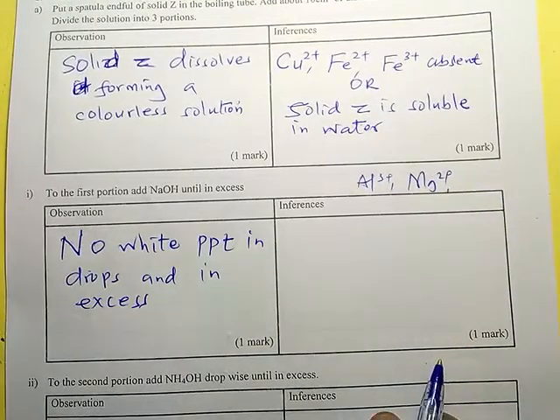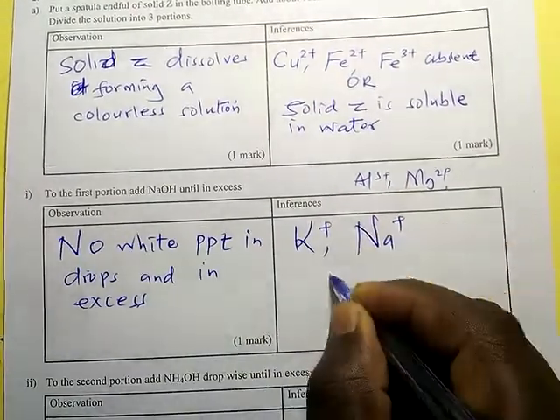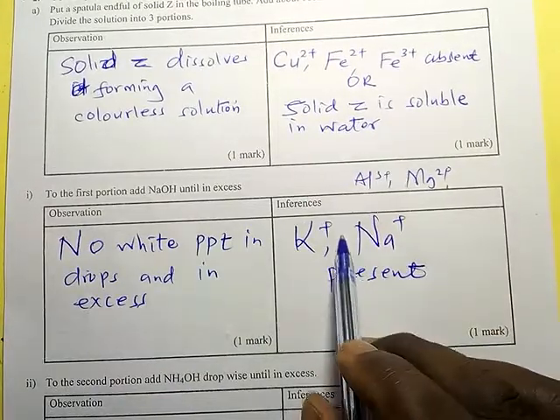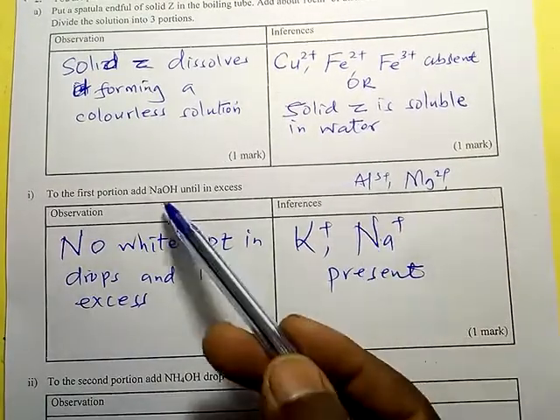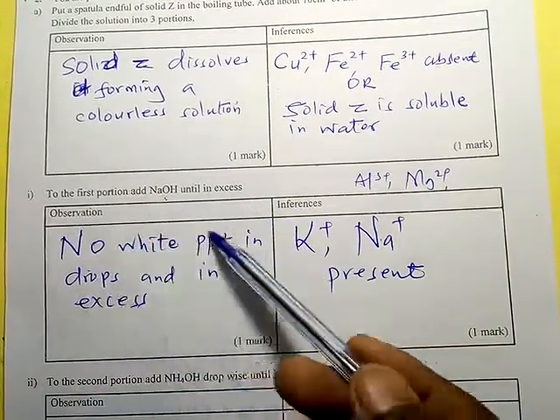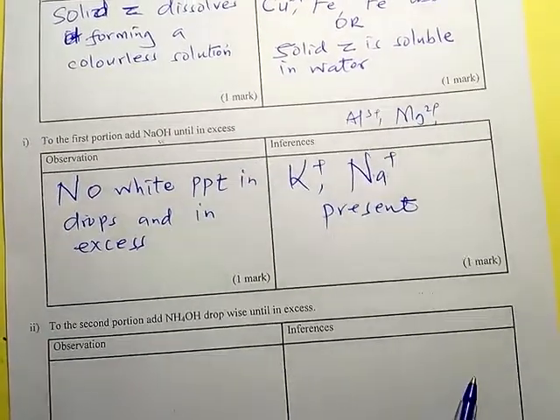So we don't want to write what is absent, we want to write what is present. So what would be present here? We suspect that potassium ions, sodium ions could be present. Why? Because we know all salts of potassium, all salts of sodium are soluble. They form a colorless solution. Therefore, the salt that was formed was soluble, because this one is potassium and sodium. So these are present.